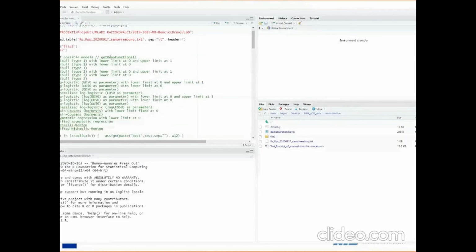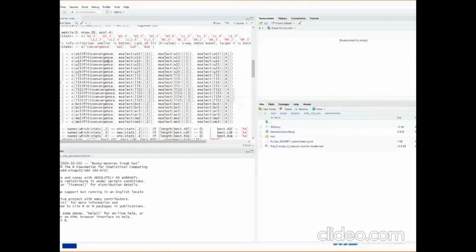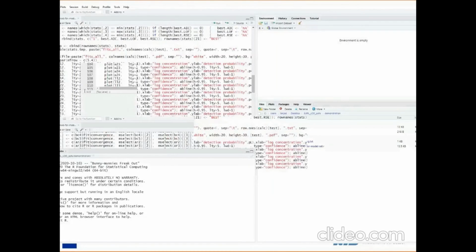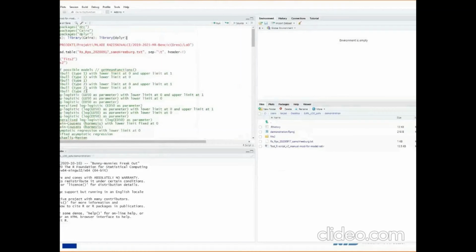So this is basically all that we were looking at during the presentation, with this large part that was not in the presentation that is just executed in the end. Here you can see that I have the same address as was in the video demonstration. But at this stage I want to change this.